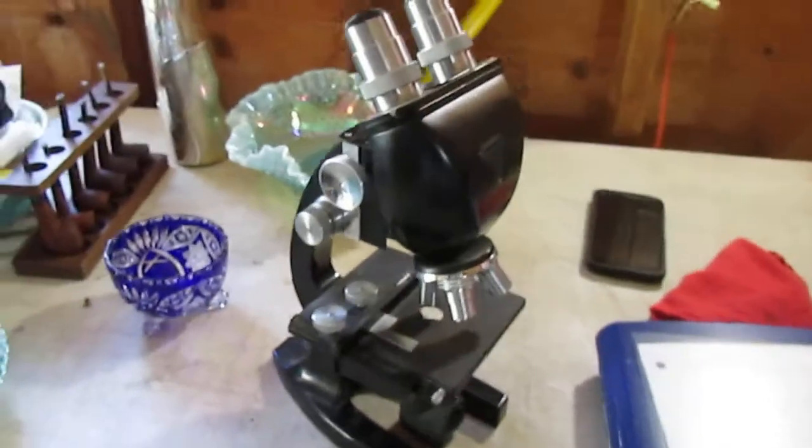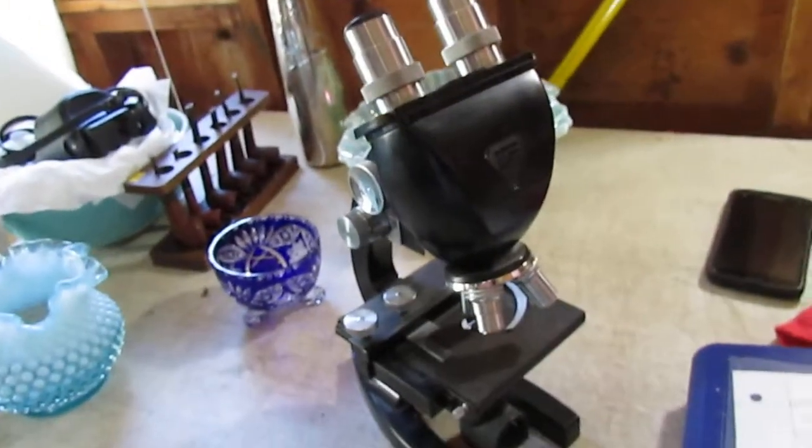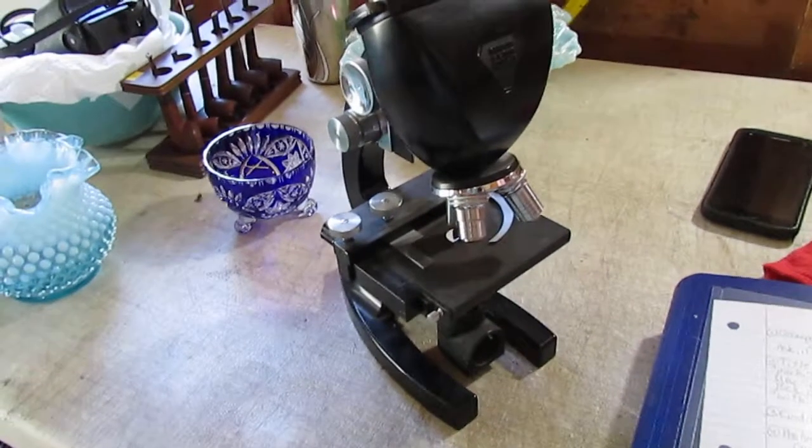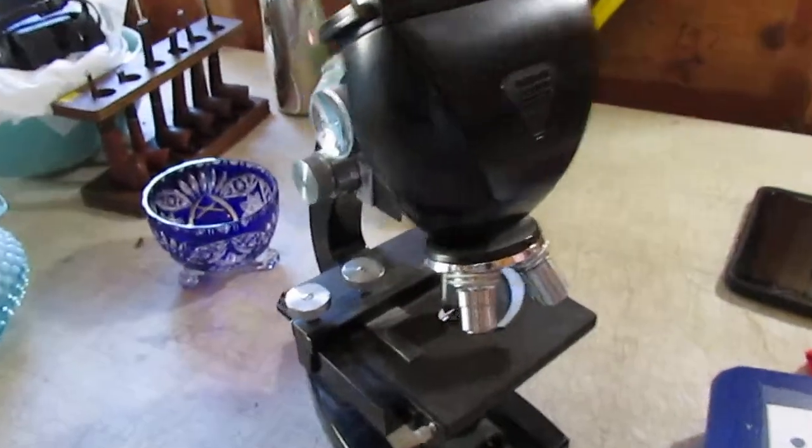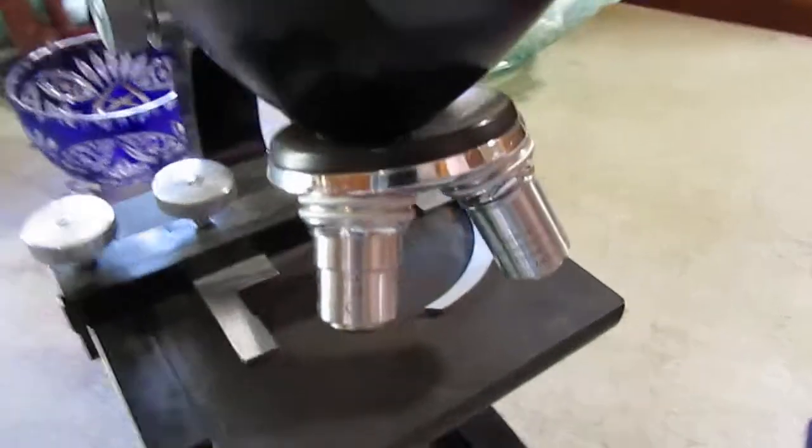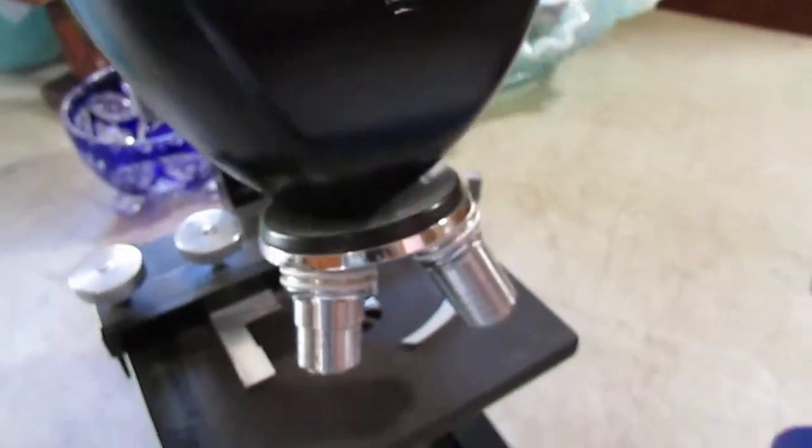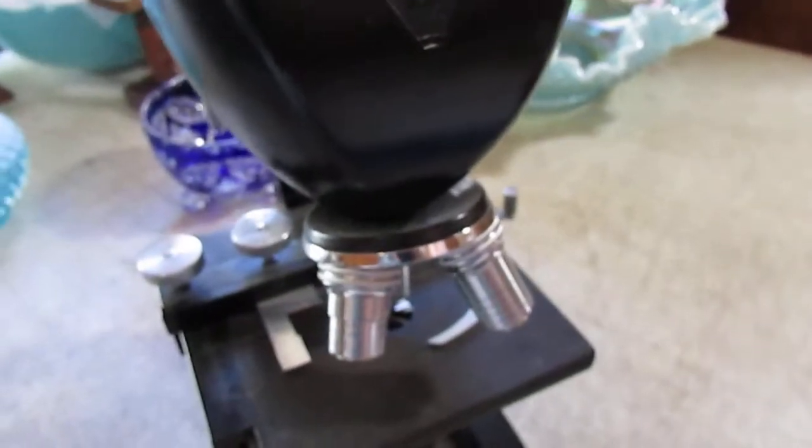In this video we are looking at, I believe, a circa 1940s Bausch & Lomb microscope. And this comes with a 10x, a 43x, and a 97x lens.